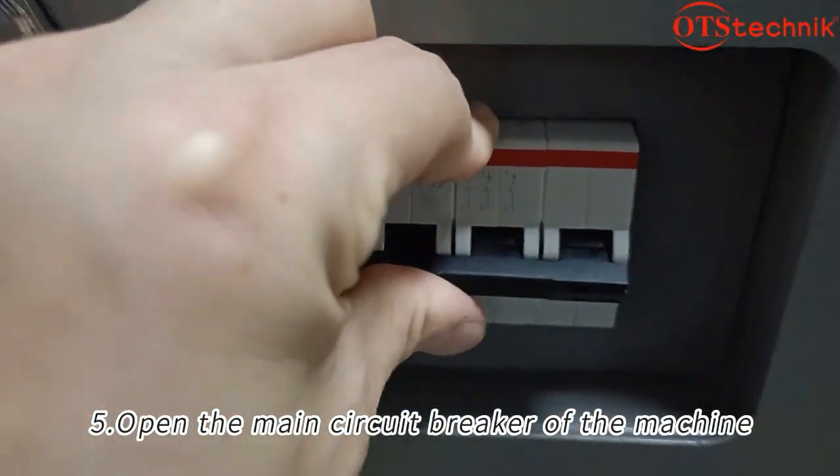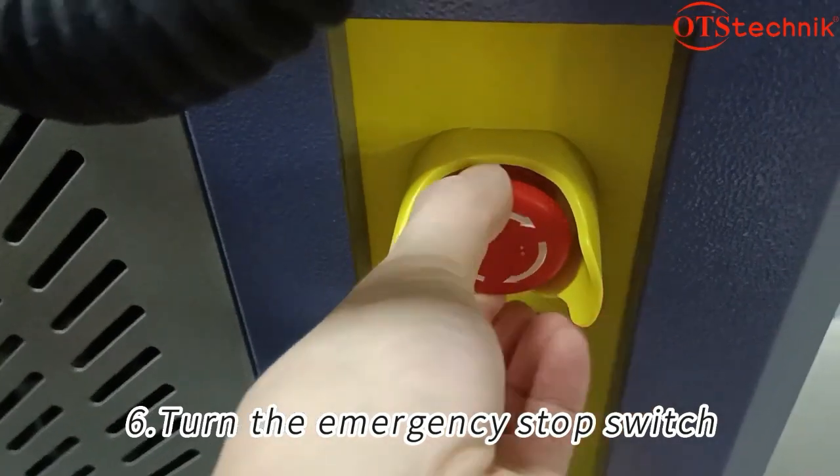Open the main circuit breaker of the machine, then turn the emergency stop switch.